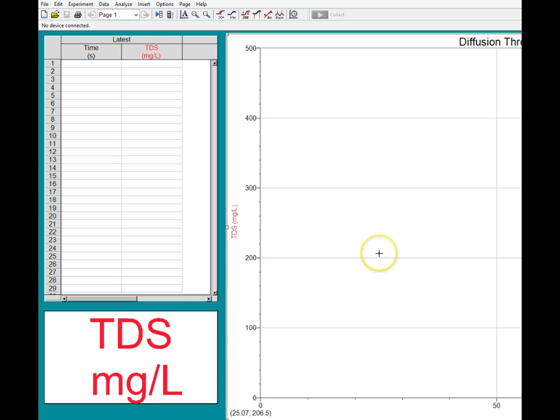At the end, you're going to want to find the slope, because that's also the rate of diffusion, to let us know how quickly the particles are coming out of the semi-permeable membrane. So you can do that by clicking this button right here. It's got the little R on it. When you click that, you'll get a little box that pops up, and it'll have a line that points to the line that it's referring to. It'll say M equals, and that's your slope, and that's also the rate, which is what you're going to need to record on your lab.